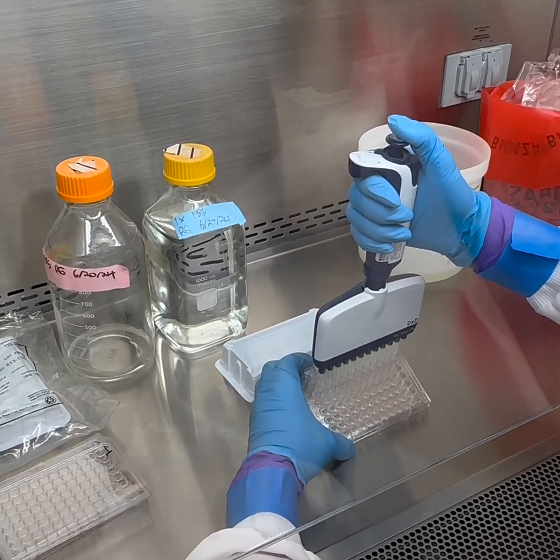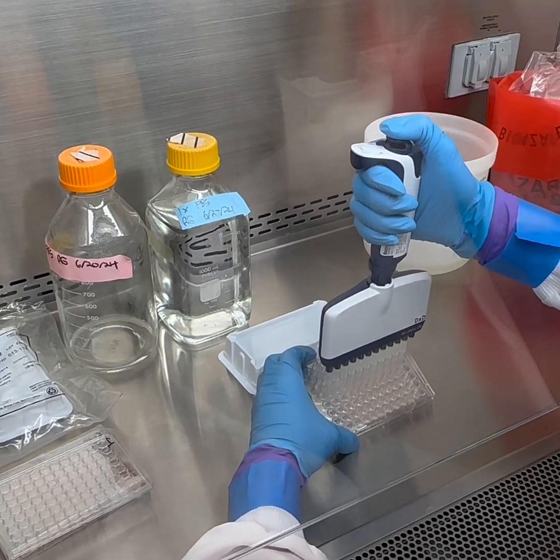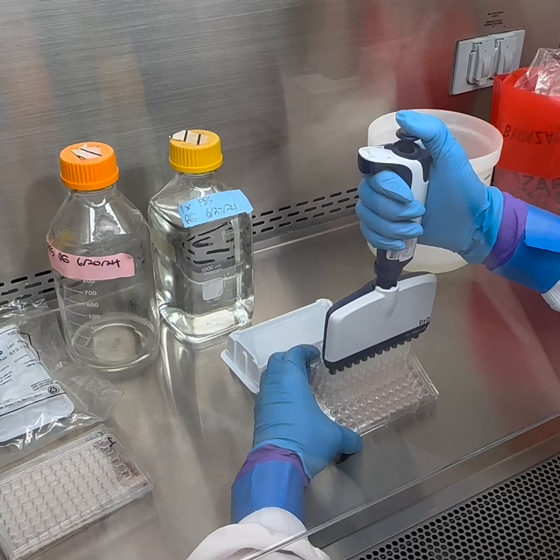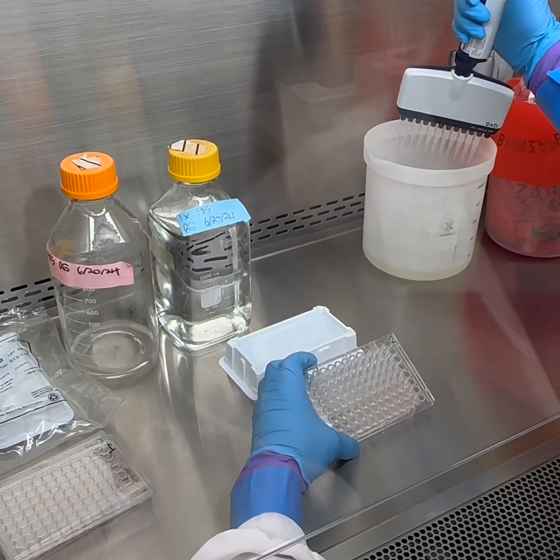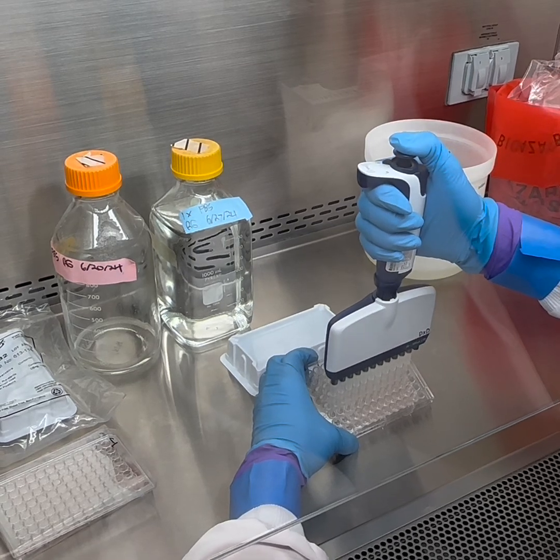So if you're doing it at BSL-1 and you're able to flick it out and tap it out, then 3 times would be preferable, but for time and safety's sake, we're just washing once.